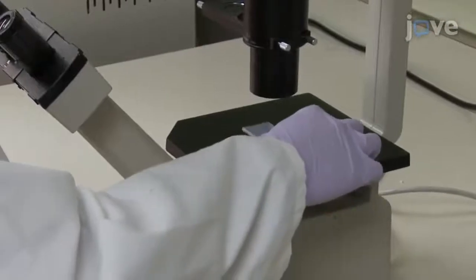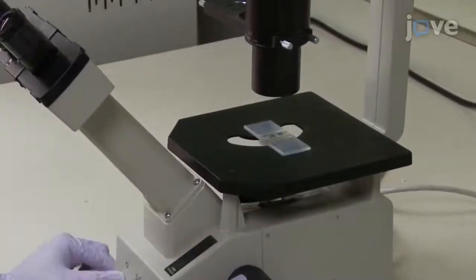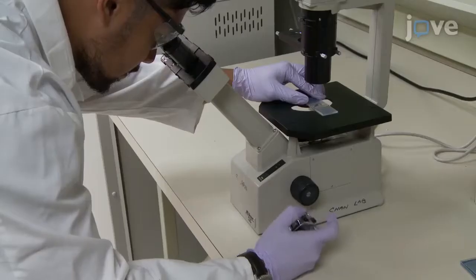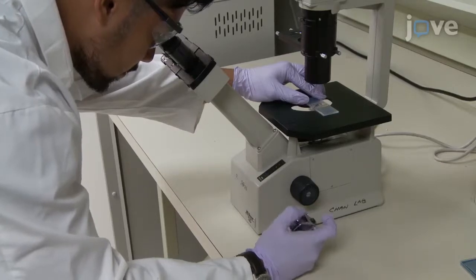After preparing human macrophages and apoptotic Jurkat cells, use a hemocytometer to count the apoptotic cells.